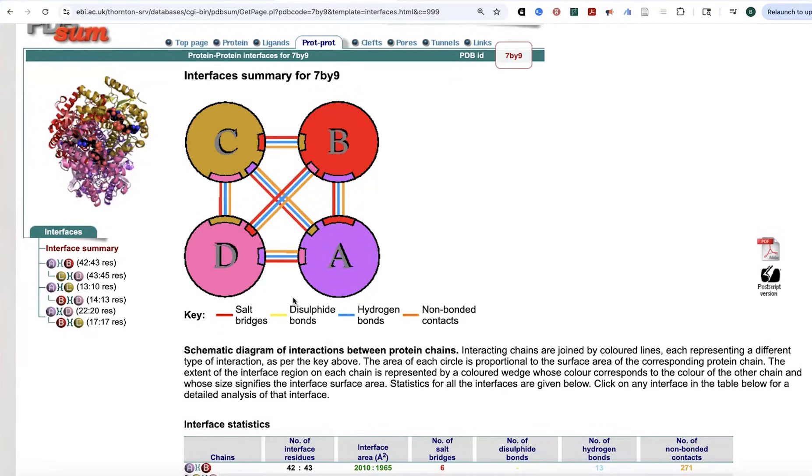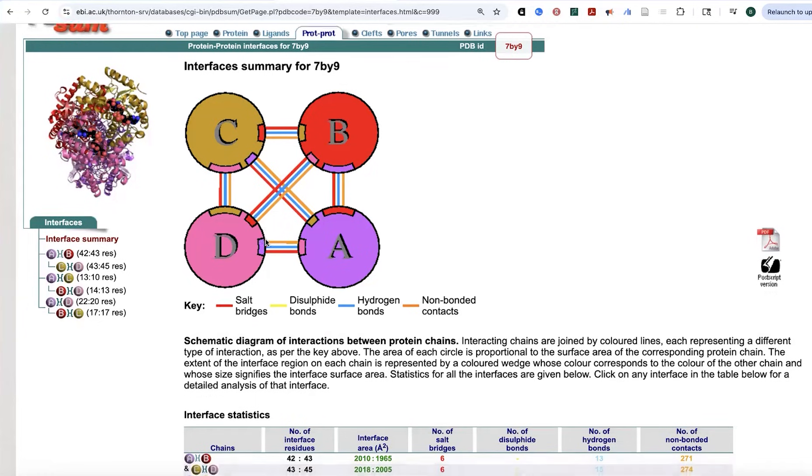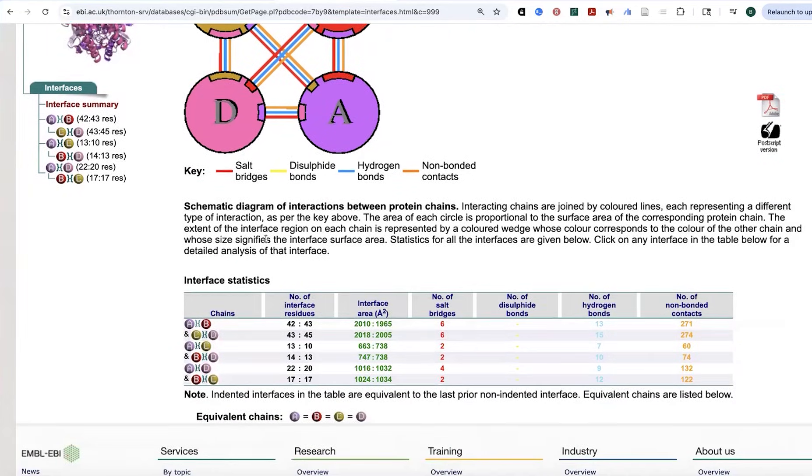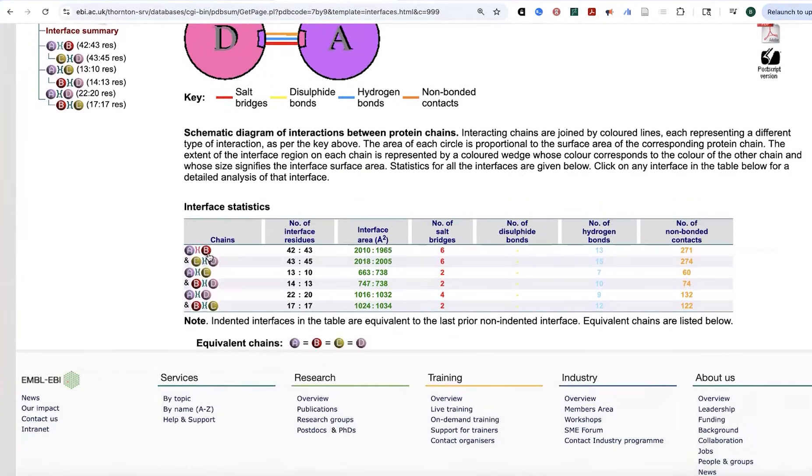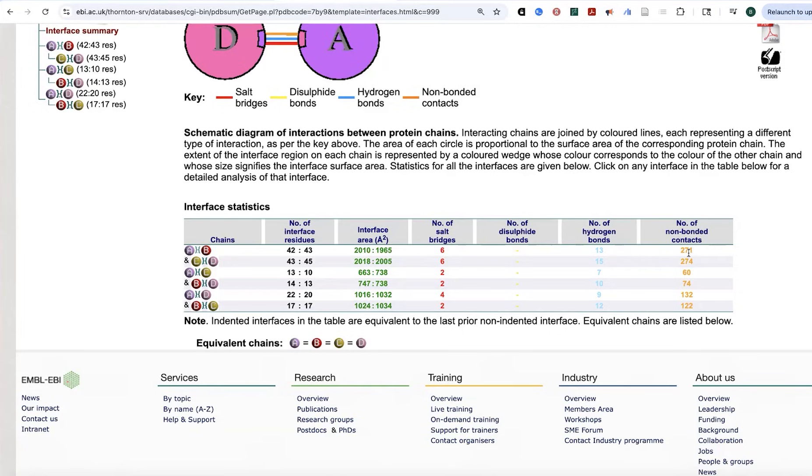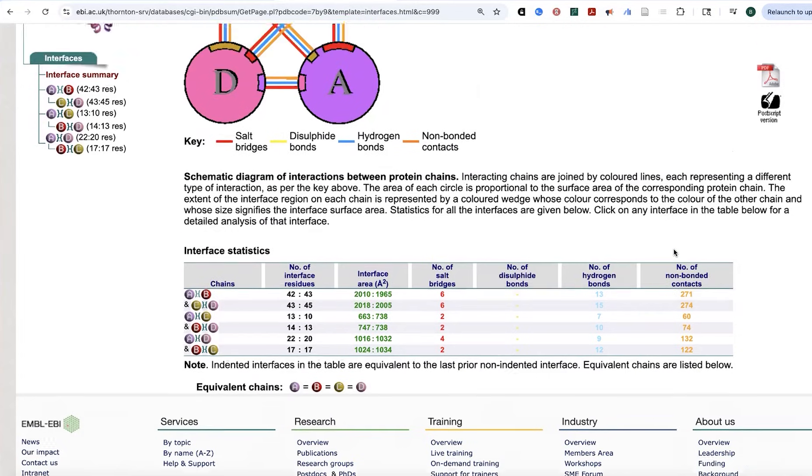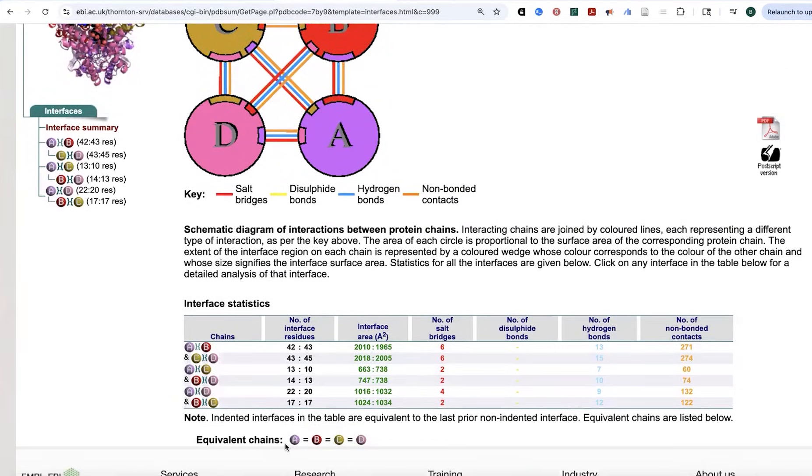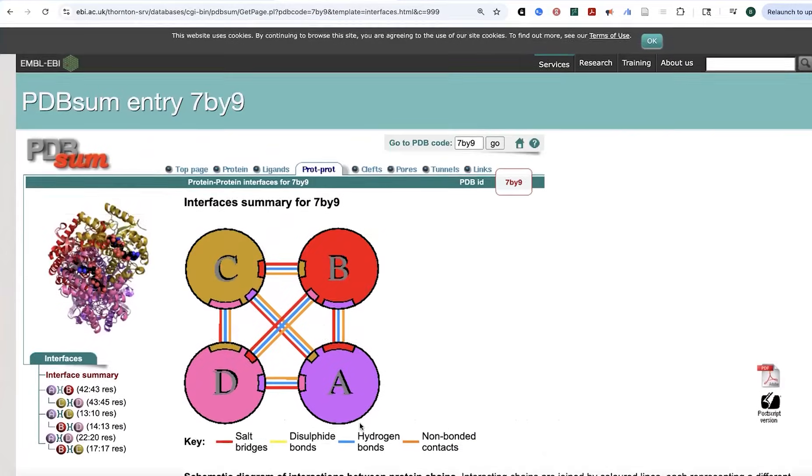If we come down here, we can get more information. So we can see the number of residues that are at the interfaces between these subunits. The size of the interface between them, and the number of different types of bonds, as well as the non-bonded contacts. And again, it's telling us these chains are equivalent in their sequence.